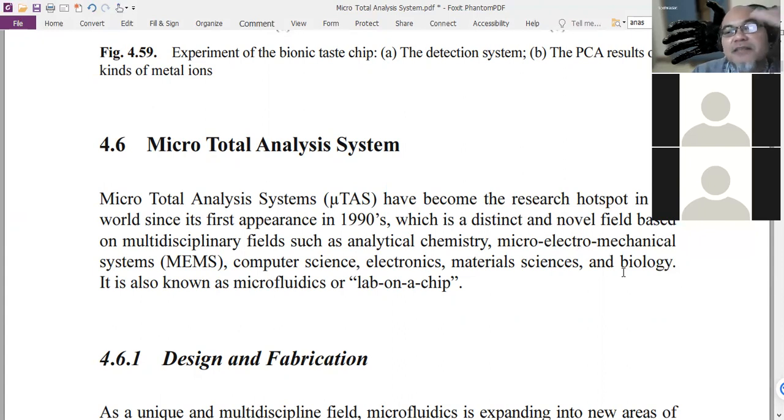Yeah, so the wax is being transferred from paper to cotton fabrics, because we cannot directly cut the cotton fabrics using a digital cutter. It's just difficult. It's easier to cut the paper. So the paper is used as a template to transfer the wax pattern into the cotton fabric. So please ask Grace, the paper. Please read the paper. You can also ask Diana and Eldora.